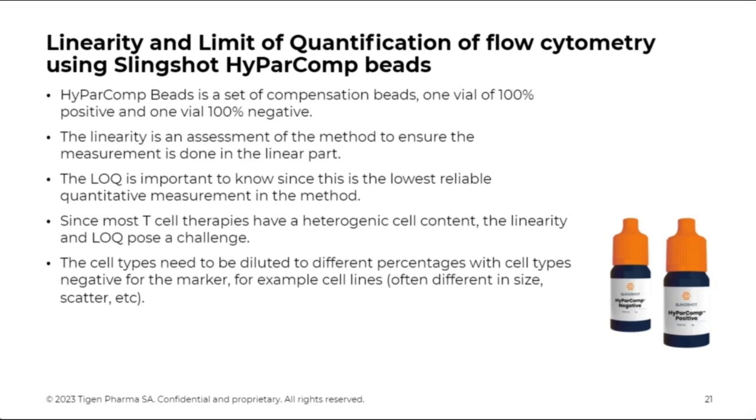And as I said, we want to measure the linearity to make sure that the assay is linear from 0 to 100, or at least knowing what the linear range is. The LOQ is very important to know because it's the lowest reliable quantitative measurement in the method.